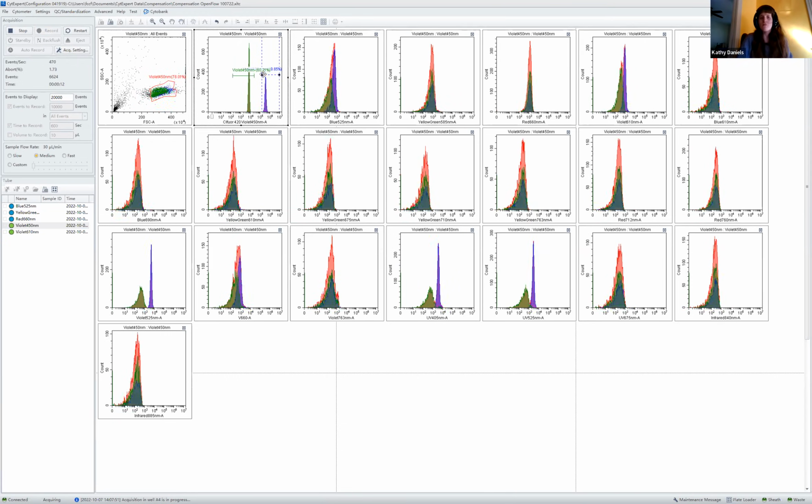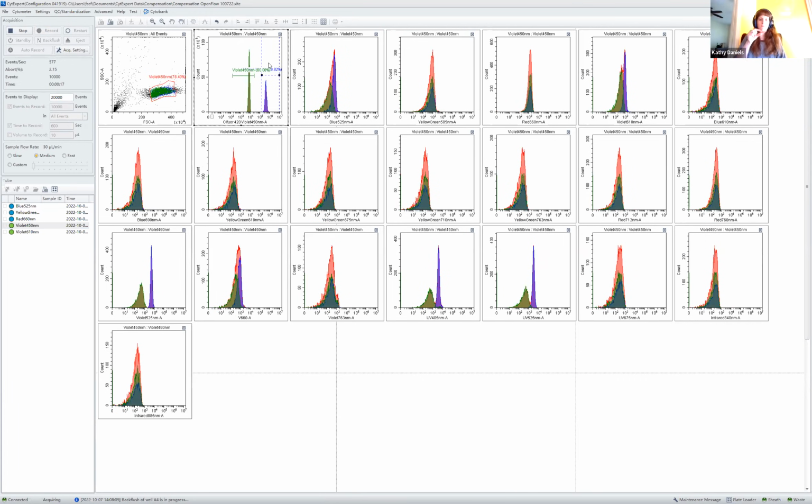What you also need to recognize as well, though, is that there is a loss of volume through the boost function. Like I mentioned earlier, there's a long distance between the probe in the well and the actual flow cell itself. So in order to not sit there and wait too long to see your sample, there's a boost function that's carried out that allows you to see your sample quicker.